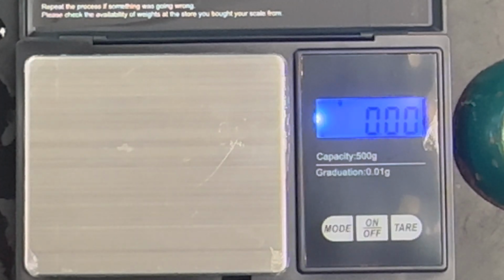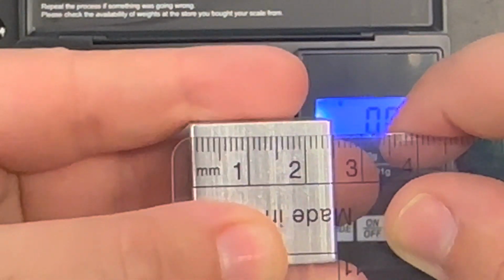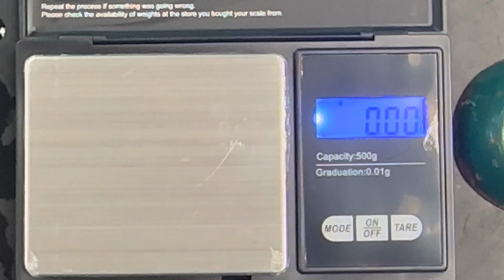And all the cubes are the same size, but just to show you, this is going to be 2.5 centimeters as well for the length, the width, and the height. So using all that information, you're going to then calculate the density, and then that's going to represent your measured value.